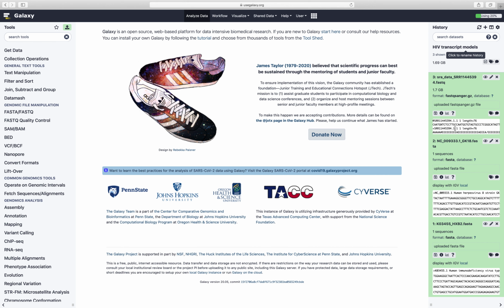So just to briefly compare FASTQ to FASTA, FASTA is basically really simple. It just has the name line, and then it has whatever sequence is there. You can have what are called multi-FASTA files, or they're also just abbreviated as FASTA files, where you have multiple of these concatenated or just joined head to tail. So you have like this, for example, and if we wanted to add this to this, just to have a file with both of these genomes so that we don't necessarily have to do these analyses twice, we can just use them almost like 2 separate chromosomes. If you want to think about it that way, you can do that as well.